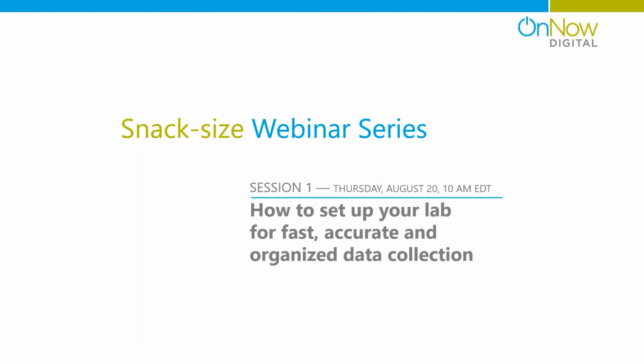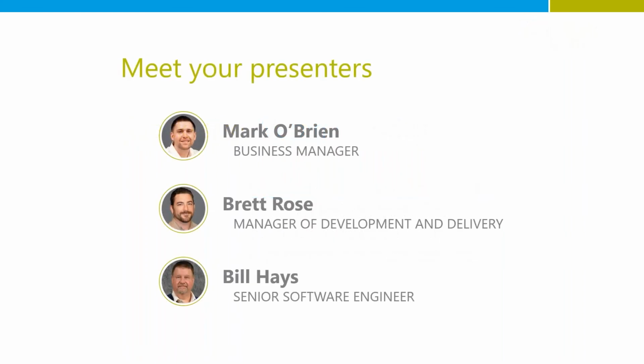This section here is covering that first topic of how to properly set up your lab data for fast, accurate, and organized data collection. So we're really emphasizing the gathering of the information here up front. We know that there are ever increasing demands on all of our time, and that the goal is really that we're always looking for ways to improve, to speed up our accuracy and our quality. And so we're hosting these just as a means to try to help you accomplish that in your everyday work.